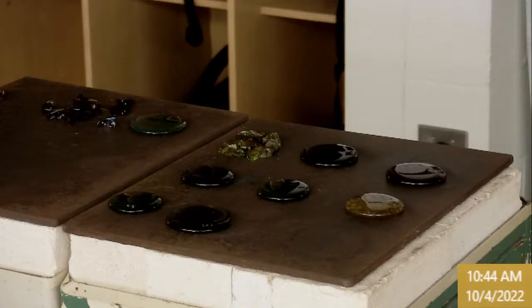Whoa. These were on fire. And so was left. Full heat, Paul. All right. I'll take those. Okay. So what's that? That was good. We got about two heats left. Okay. What we're doing now is we're going to peel this ball open flat to make the wall piece. So this is not normal manufacturing at this point. That's definitely art there.